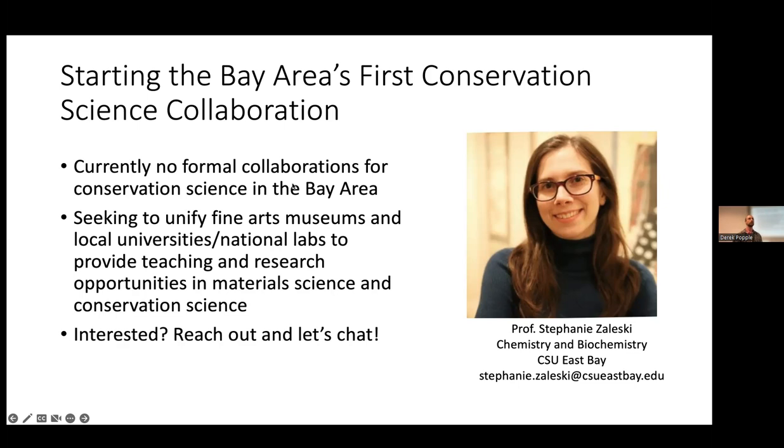The ability to do 4D STEM is becoming more popular, but it is restricted to certain facilities. There are big groups at UCLA that do this, and the National Lab in Berkeley does it. It's key at strong microscopy schools, but even if you're at an R1 that doesn't have strong microscopy, you may not have the right detectors to conduct these studies. Luckily there are a lot of user facilities where people can gain access, and with a couple of sessions, you can get some good insight.